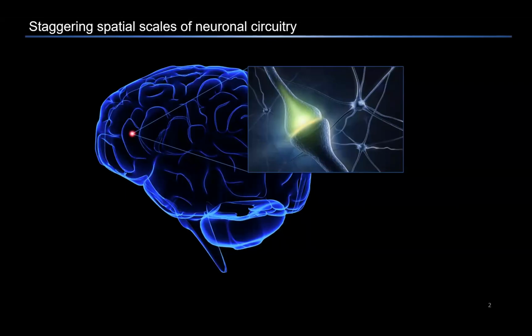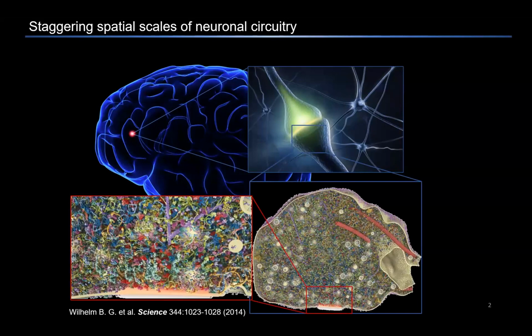So expansion microscopy is a super resolution technique that only emerged, I think, roughly 11 years ago, basically from Professor Ed Boyden's lab at MIT. Initially, the motivation of developing expansion microscopy is to resolve the brain. Basically, try to image the circuitry of the brain, because brain is incredibly complicated.